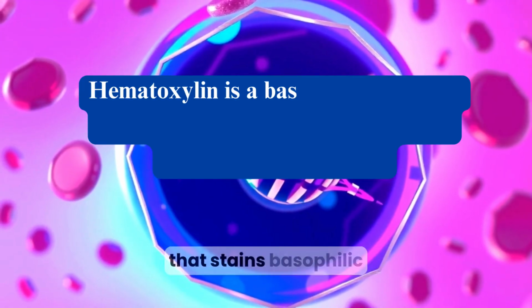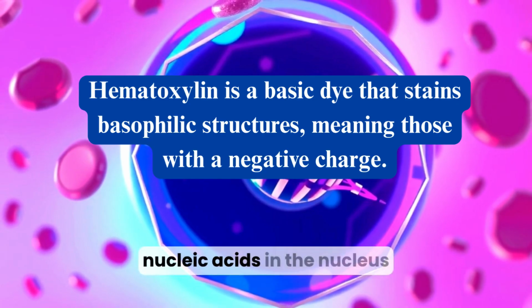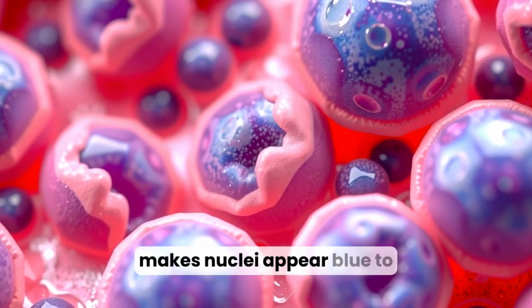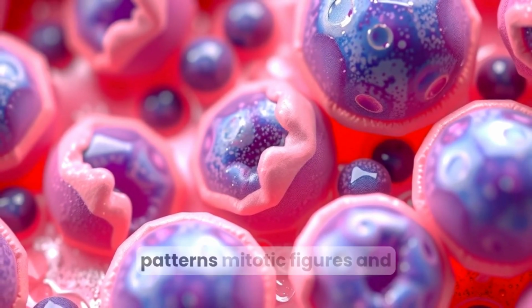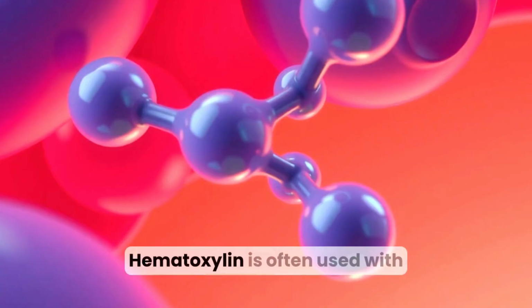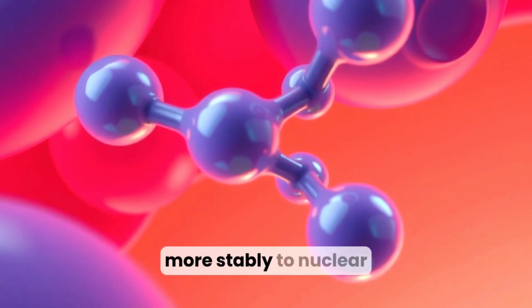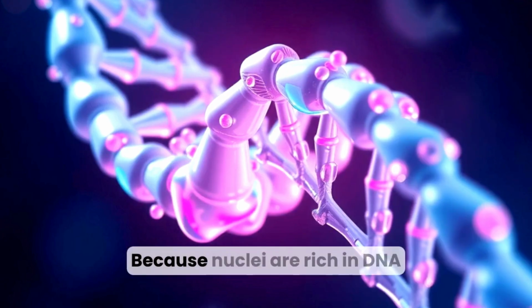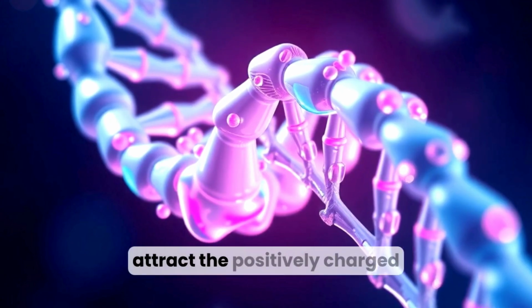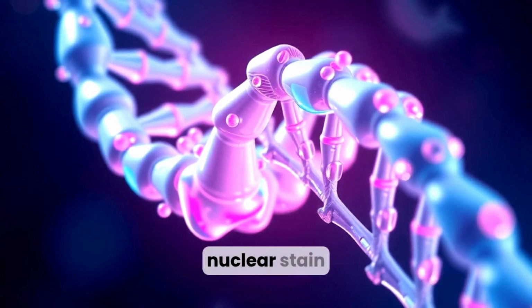Hematoxylin is a basic dye that stains basophilic structures, meaning those with a negative charge, such as nucleic acids in the nucleus. In practical terms, hematoxylin makes nuclei appear blue to purple, revealing chromatin patterns, mitotic figures, and nuclear size and shape. Hematoxylin is often used with a mordant such as aluminum to form a dye complex that binds more stably to nuclear material. Because nuclei are rich in DNA and RNA, their negative charges attract the positively charged dye complex, producing the distinctive blue-purple nuclear stain.